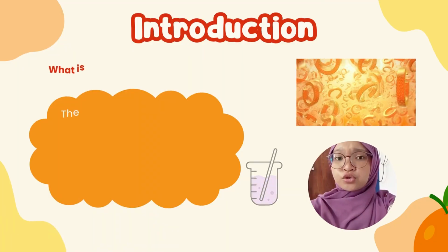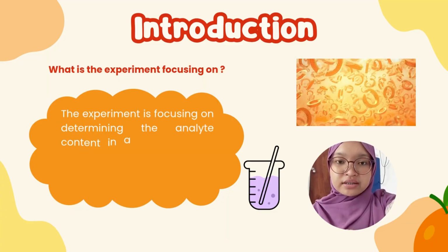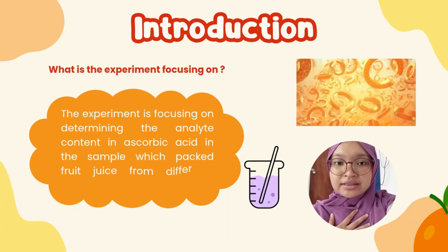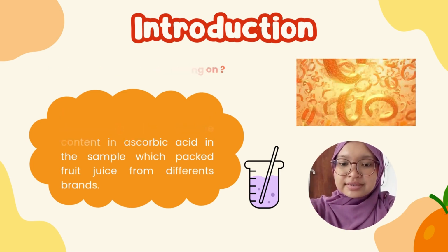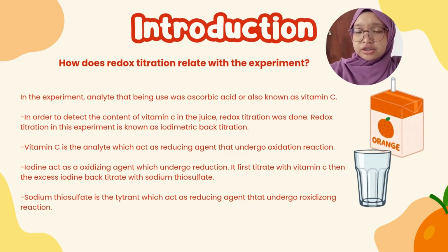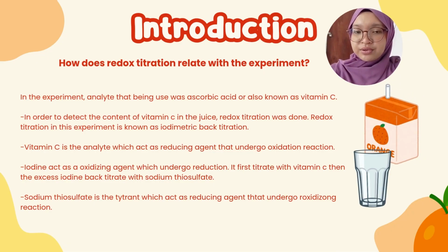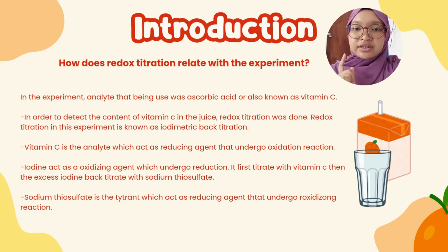So, what is our research focusing on? The experiment in our research is focusing on determining the analyte content, ascorbic acid, in packed fruit juice samples from different brands. How does redox titration relate to our research? In the experiment, the analyte that was used was ascorbic acid, also known as vitamin C.